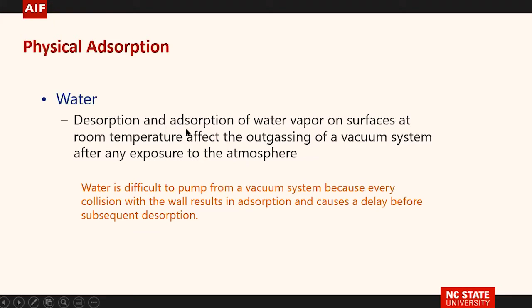What's the problem with water? Water is a really sticky molecule. So whenever it desorbs from one spot, the next spot it hits, it sticks there. So water takes a long time to pump out of a system. That's why you backfill with nitrogen, you bake systems, you're trying to get the water out. It really takes a lot longer to pump out a system if you have moisture in it. And for those of us living here in North Carolina, humidity is high, and especially this week, it's a little higher.